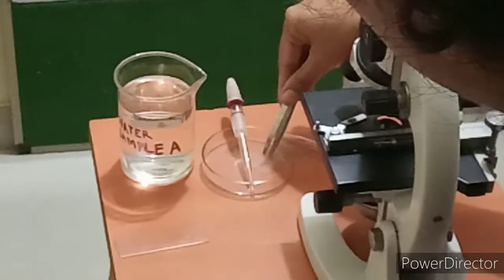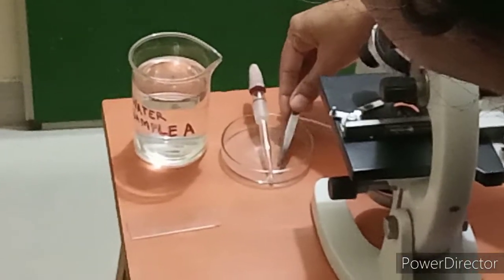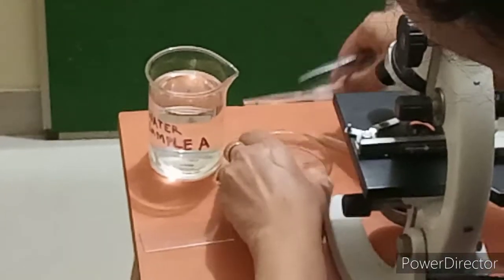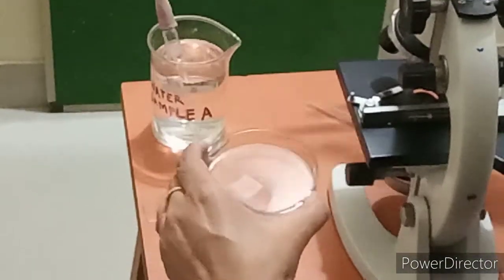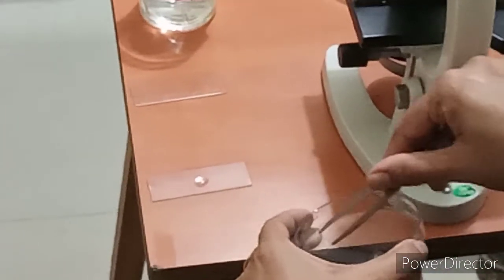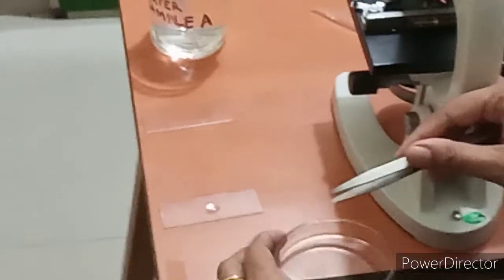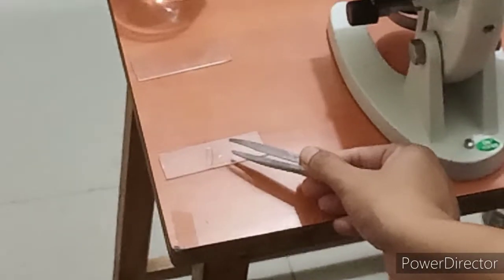Use forceps for holding the cover slip. Gently place the cover slip over the drop of water.